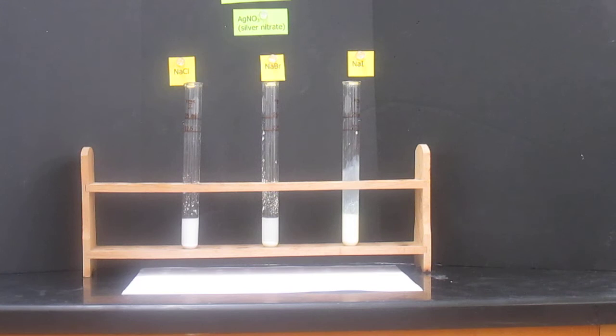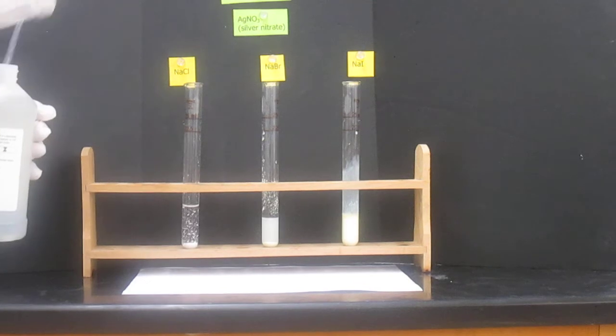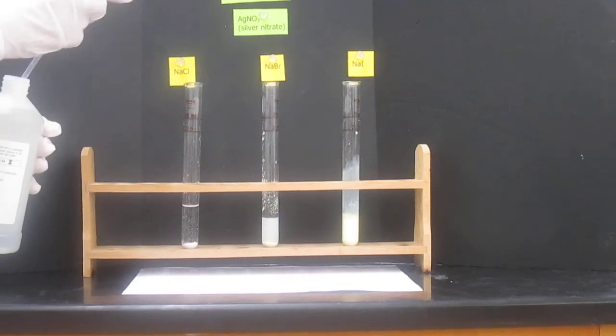And what you are watching for is to see how much of it dissolves and goes away. If, when I add a little bit of the dilute ammonium hydroxide or the ammonia solution, it goes away, at that point it is considered to be soluble. If I have to add more to get it to dissolve and go away, then that's soluble in concentrated or slightly soluble. And then if it just doesn't seem to disappear, it's going to be considered insoluble. So I'll start out. Maybe you can see that that one has already turned the liquid part clear.